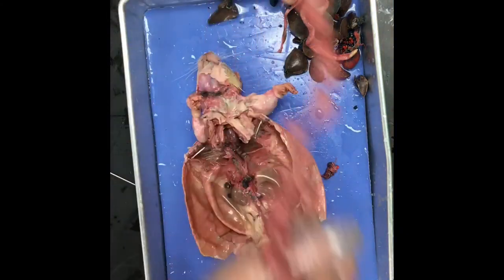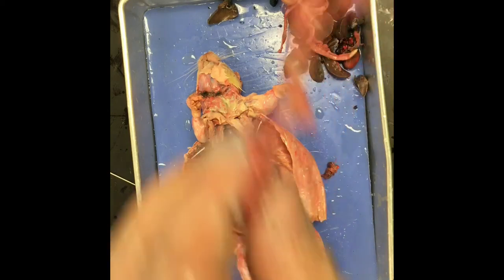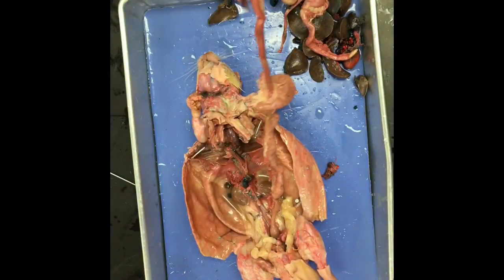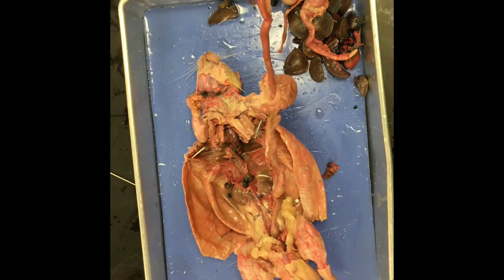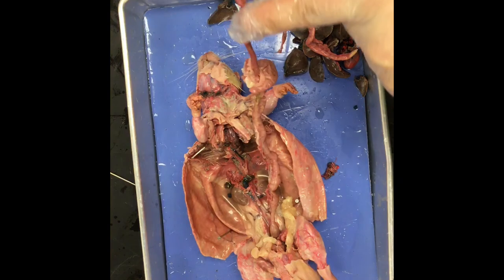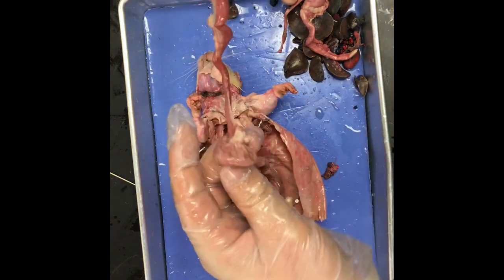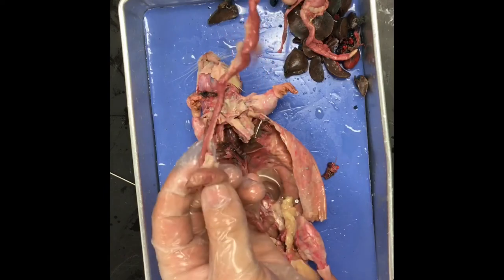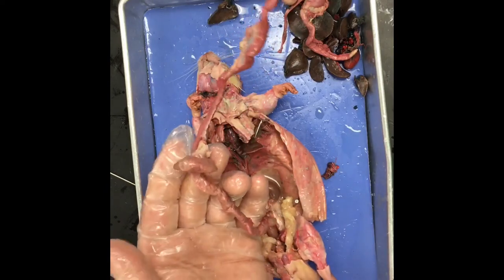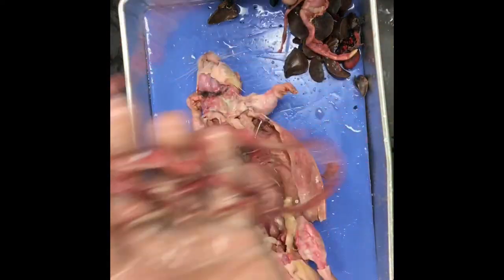So, yes, I took off about 3 or 4 inches, including the stomach. However, apart from that, here it is all stretched out. This one's a little shorter than normal. So, small intestine, you get to here, and it's the large intestine all the way back down. You'll notice it's a lot thicker and a lot shorter. The rectum is going to be buried down in there. So, that is your small intestine.